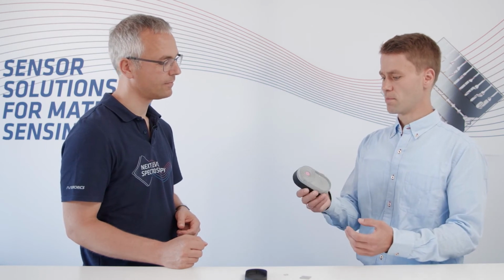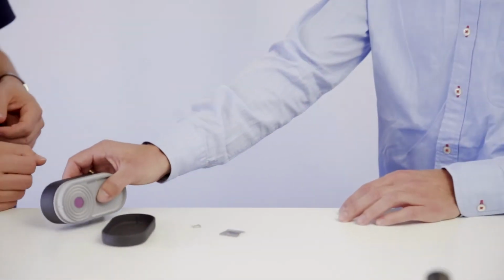This opens up applications that haven't been able to be addressed before. From your point of view as a CTO, what kind of applications, what kind of markets are possible with that kind of technology? So first, to my opinion, the biggest transition is to get out of the lab into handheld devices. So you can carry your spectrometer with you. It's equipped with a battery, and you can measure wherever you are. You can take your measurements.